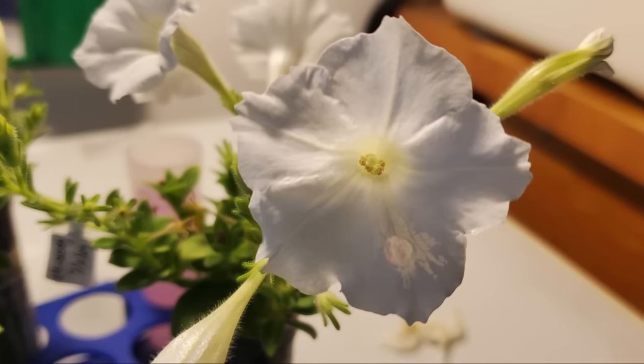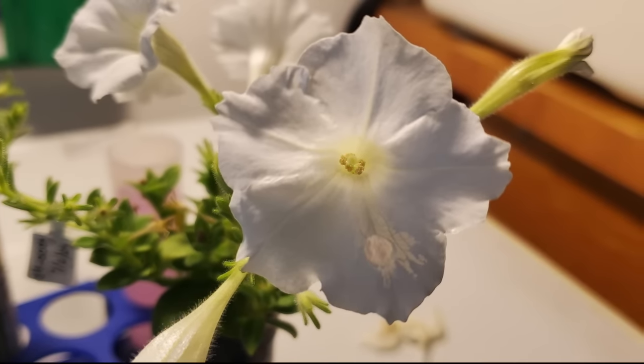Again, with no needle. And with gloved hands, you approach the petal from above, and you push the nose of the syringe against your finger on the other side, and gently squeeze the Agrobacterium into the petal tissue. There are layers in the petal that are kind of disconnected. And what you're doing is you're injecting through small micro wounds that are caused when you push the blunt nose of the syringe onto your finger, and it basically streams all of this Agrobacterium in between the layers, right? So it actually enters in between the cell layers and will hang out there for a while.